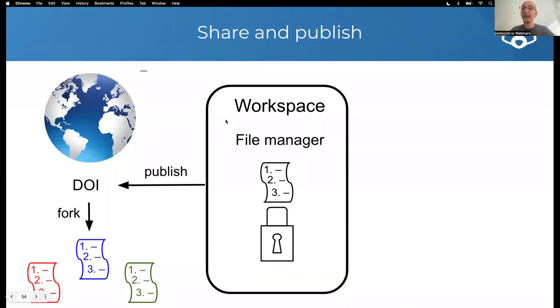Once the protocol is published, any reader can copy it and modify it according to their needs. So any public protocol is a template for further improvements. However, the platform has a memory that will link any copied protocol to the original one. And in this way, the original authors can keep credit.